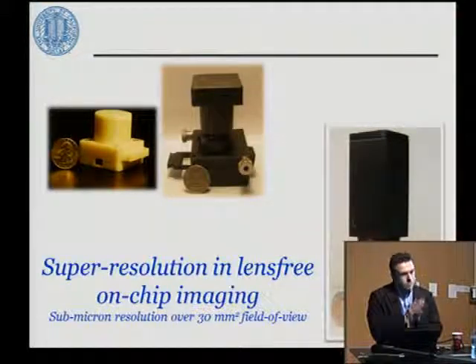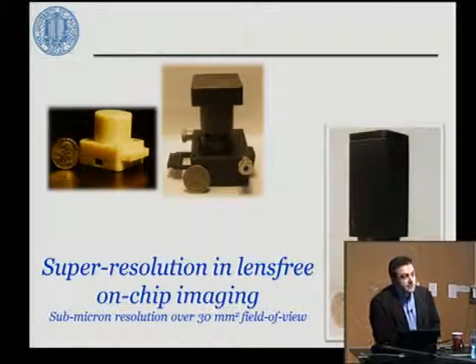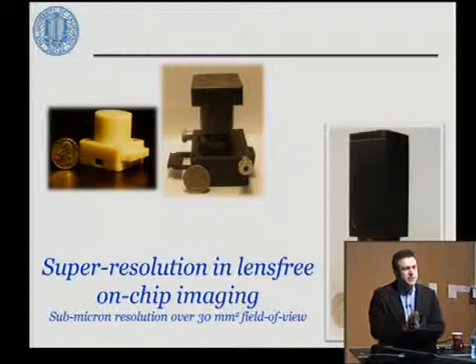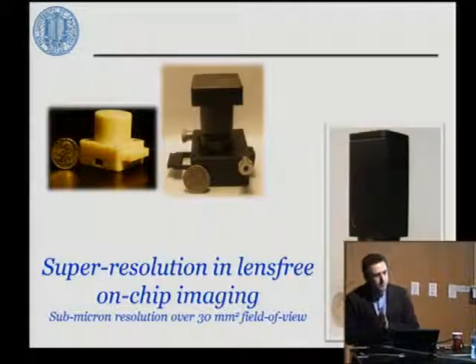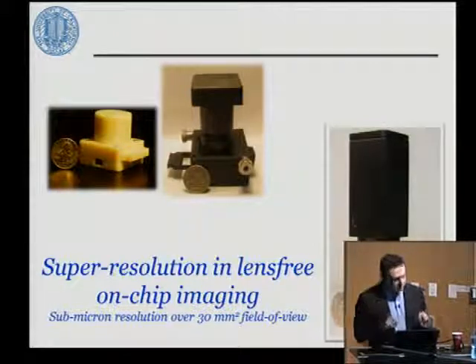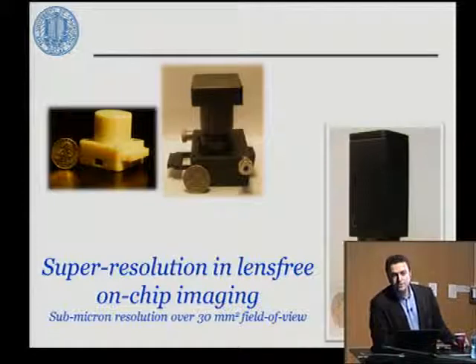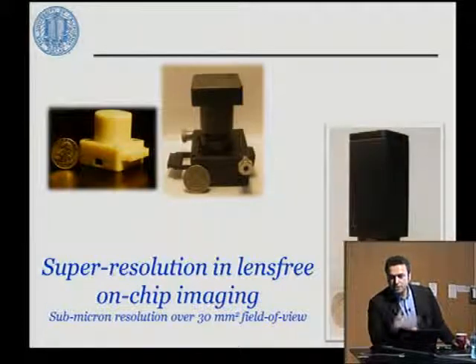For this, we've borrowed some mathematical frameworks from especially photography literature. And we use pixel super resolution to essentially digitally embed more pixels to our native holograms. A quick disclaimer, super resolution is first used in photography literature before fluorescence microscopy started to use it for beating the diffraction limit of light.